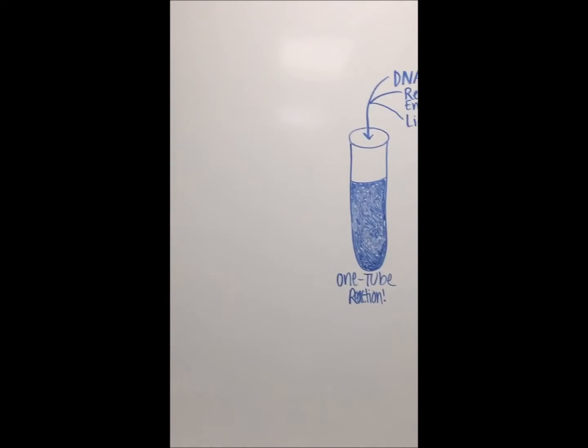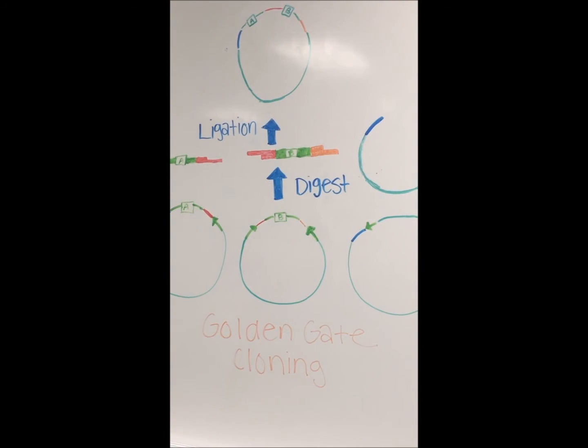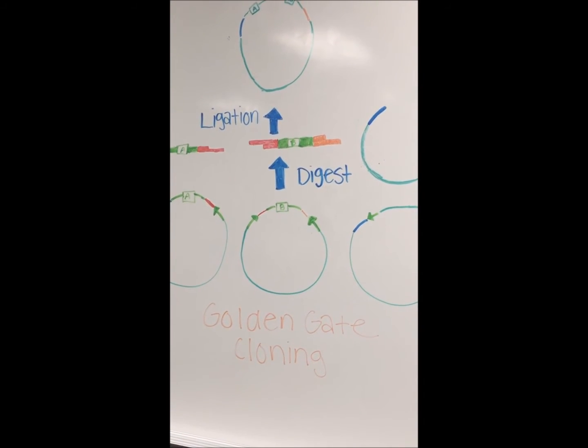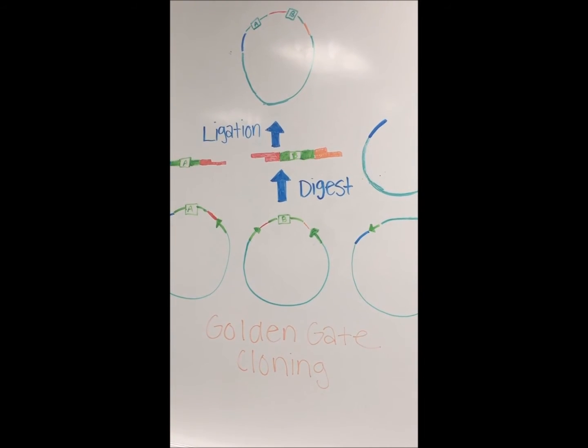Methods have been proposed to introduce type 2S endonuclease sites into plasmid backbones to assemble BioBrick parts together using Golden Gate cloning. Assembly using Golden Gate cloning is advantageous over traditional cloning, as there will no longer be SCAR sequences between joined BioBrick parts. These methods are further described on our website.